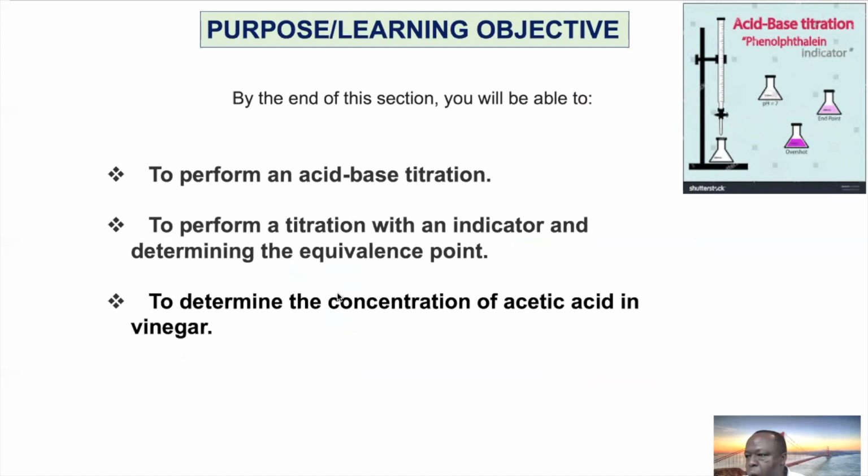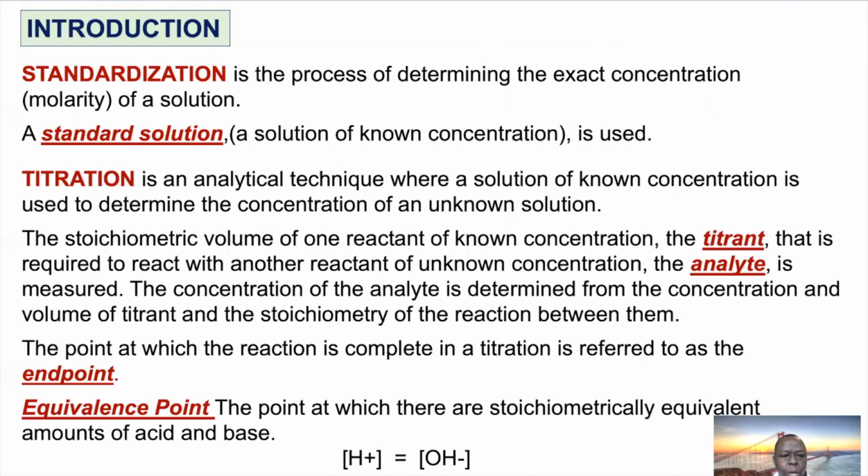The process by which you add a small amount of titrant into your analyte is called titration. Perhaps you have performed this experiment before. We call this titration. There are also some points along the titration curve we call either the endpoint or the equivalence point.